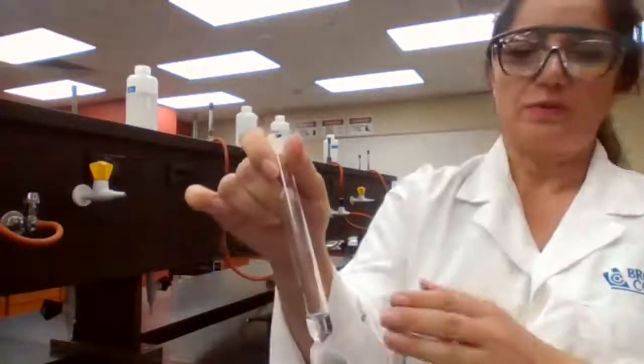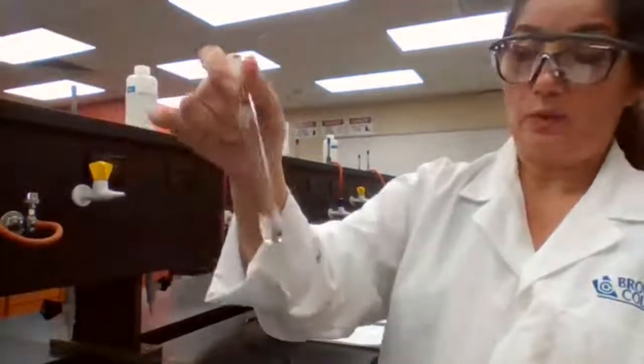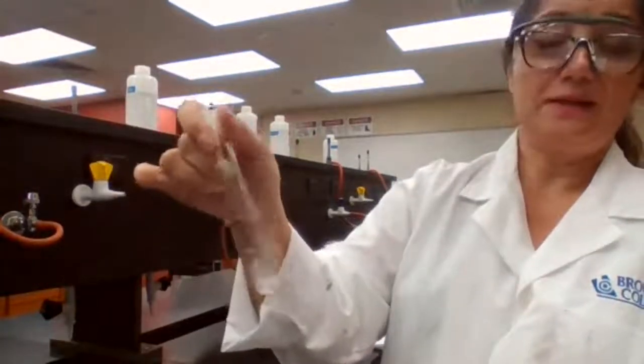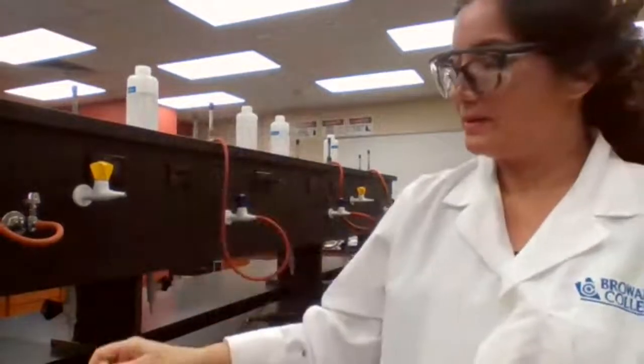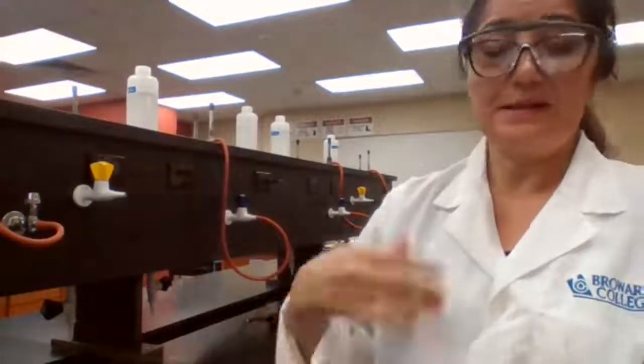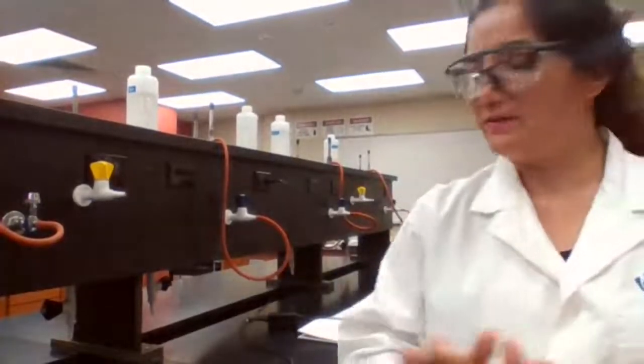What happens when the ammonium chloride in water is being heated? Would it dissolve better, or if it's cooled down, would it dissolve better? If heat is needed for something to dissolve, the reaction is going to be considered an endothermic reaction, as I said earlier. So we are done with part C of the experiment.